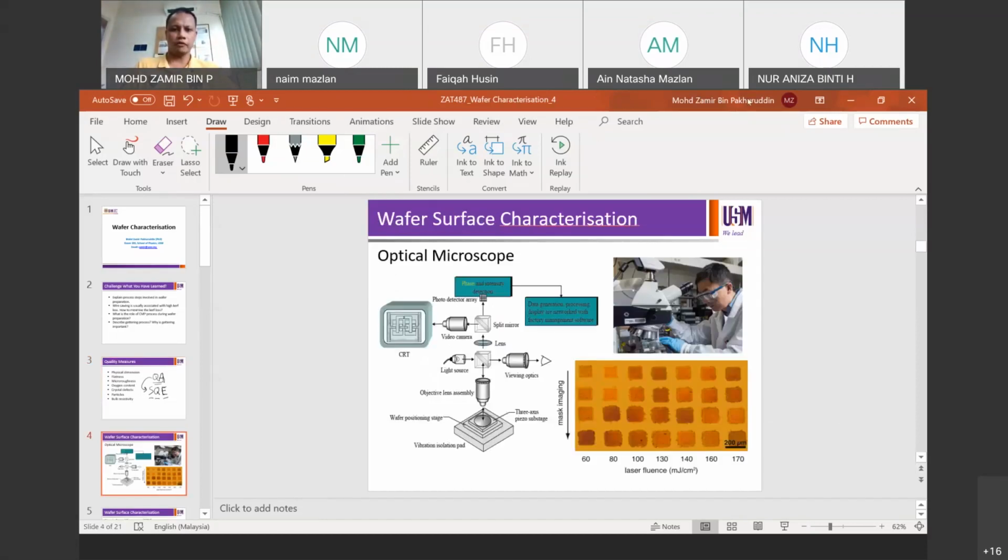So we have a couple of techniques that we can do to characterize wafers. Well, normally when you look at the quality of the incoming wafers, there'll usually be a data sheet or something that summarizes the quality of the incoming wafers. Like all those parameters you've seen on the previous pages, roughness and oxygen level and defects and particle count and whatever. So they are usually summarized in one document along with the incoming wafers. So these parameters have to be scrutinized by the SQE team to make sure that they are eligible for the fabrication process.